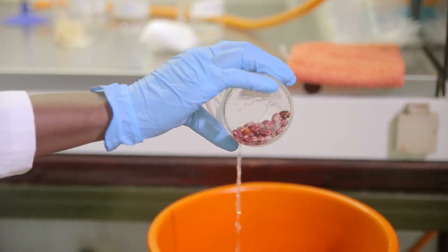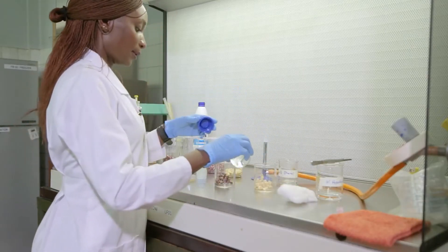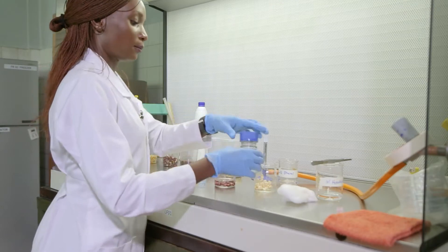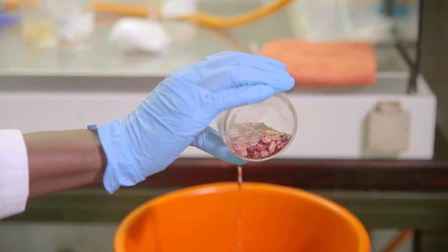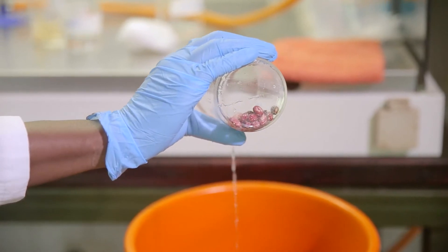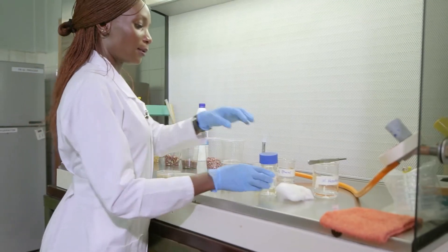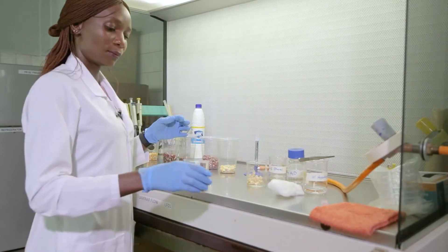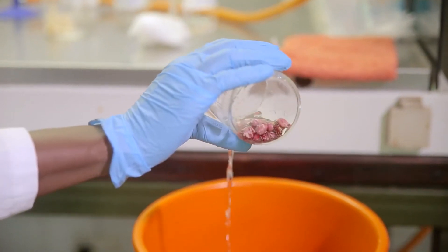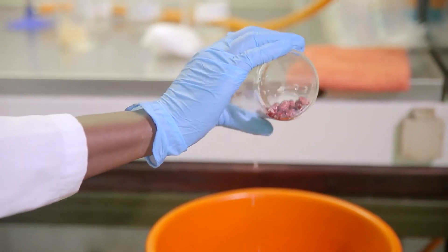We pour off the hypochlorite that we put in the beans. Wash it off with sterile water. Our aim here is to disinfect the surface of the seeds, just in case we have any fungi on the surface of the seeds.